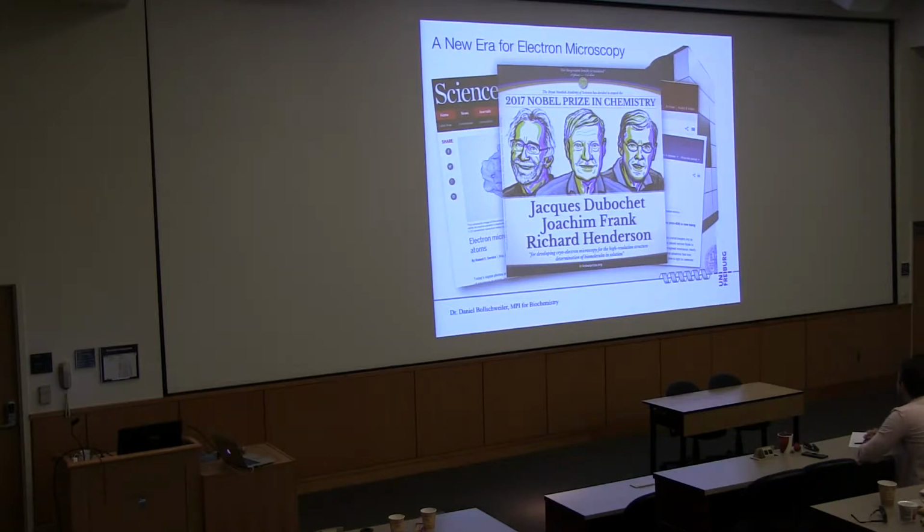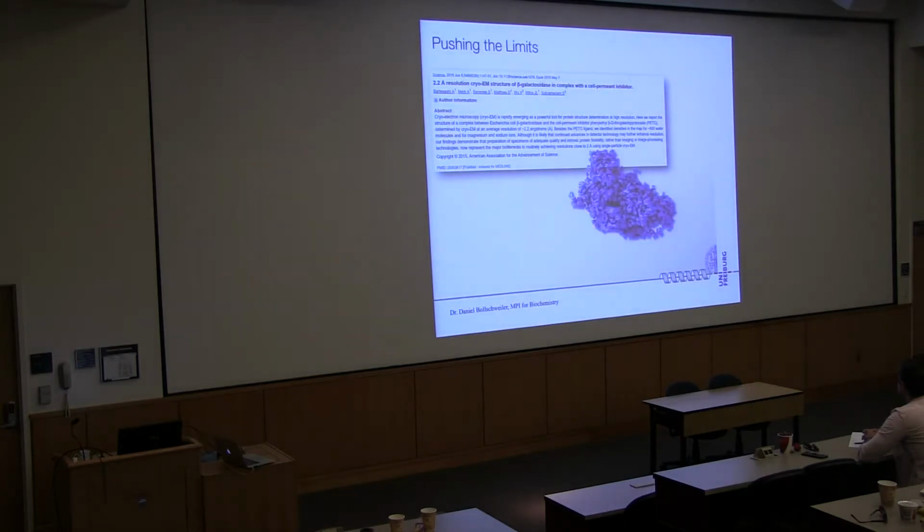And that is really what we did all the time. That is crystallization in the computer, because that's what the method really leads to. And of course the successes of the method are then structures up to 2.2 angstroms resolution. This is already 3 years old. It didn't get much further since, but a bit. And you get electron density maps that look worse than a crystallographic map at the same resolution, but that is actually because this is a real experimental map, while we are a bit cheating. I'll tell you about that.